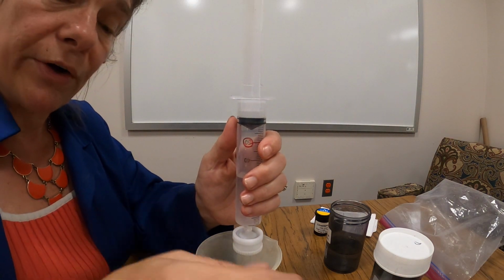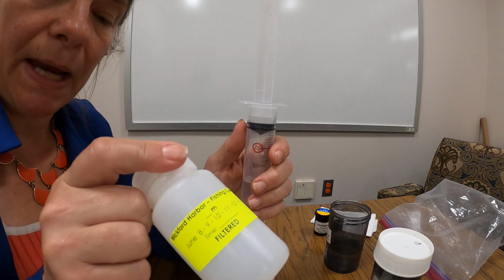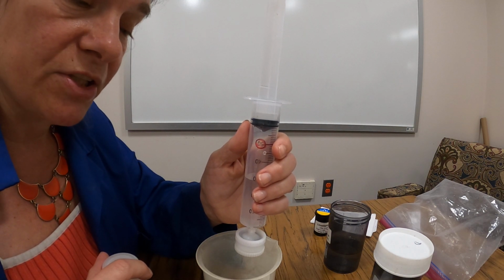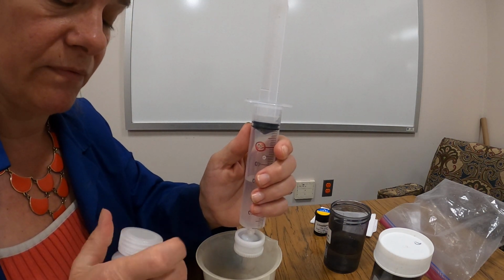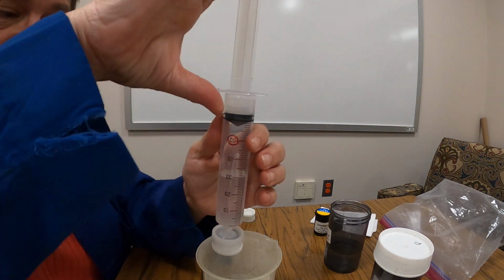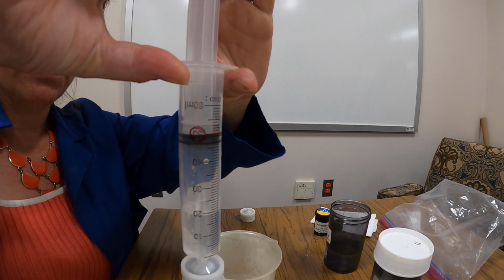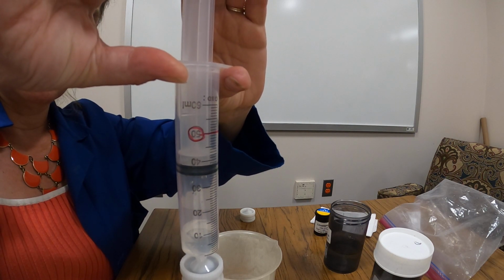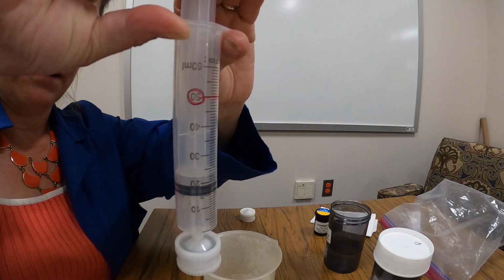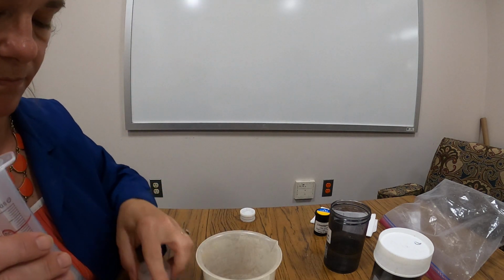And if this were a water collection day, in my water sample bottles, I might have a yellow labeled bottle that says filtered on it. And on those water collection days, if you can remember to, it's really helpful for us if you collect some of this water, and that's all it is, filtered water. So we're just going to, again, with a slow, easy pressure, push all the way through that air gap, getting rid of the excess water.